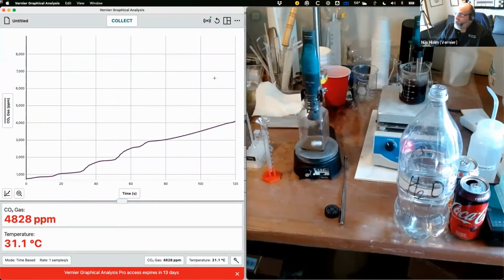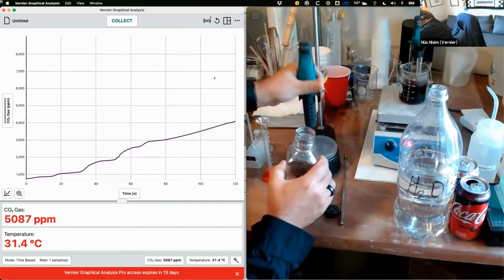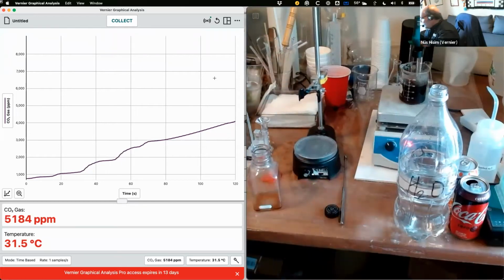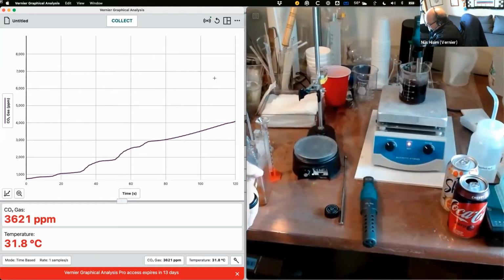So let's do one more point, and then that'll give us plenty of time to do the analysis together. Is everybody getting the runs? If you want to look at the other ones on your end, just tap on the y-axis label and you can switch and compare them.